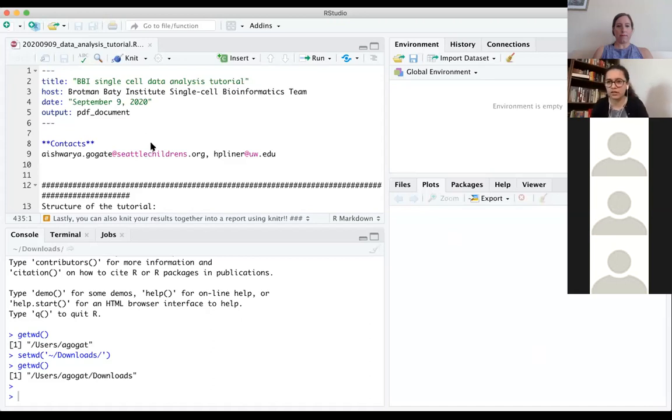Okay, can you see the RStudio? Okay, great.